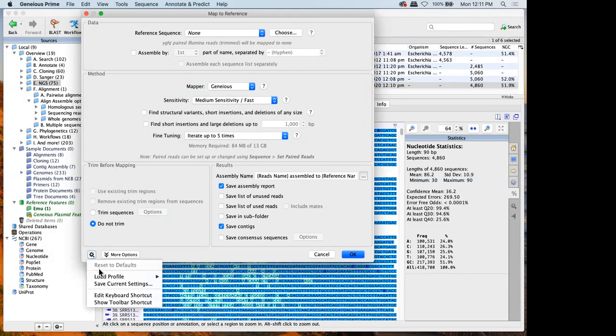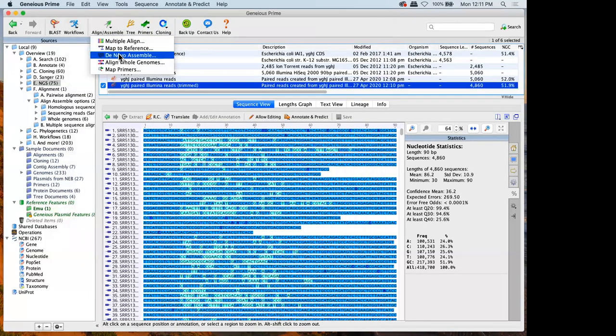That's going to allow you to reset to defaults. If it's grayed out, it means it's already on the defaults. Now, when you're working with NGS data, in Geneious or elsewhere, it can require a lot of computer power and a lot of RAM, and Geneious is a desktop program. In general, de novo assembly is going to require the most power in Geneious. So if I do de novo assembly, these are the most computer spec intensive tools. Map to reference is not as greedy.